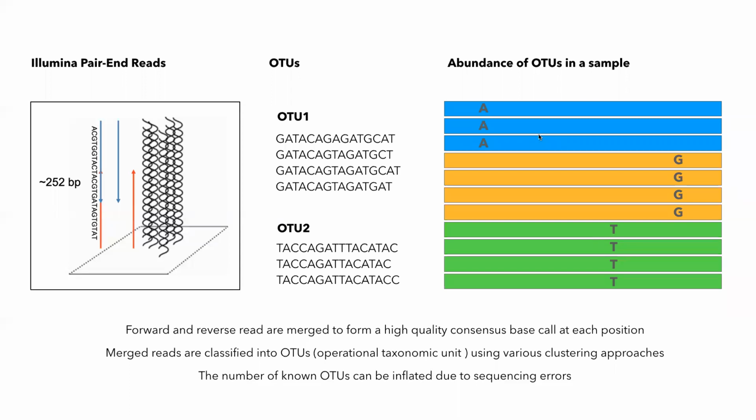So, and this is one of the challenges that we're going to be facing. As you remember, standard pipeline, we're just mapping it on database. And when we're just mapping on the full sequences in the database, really, they can fall in a lot of different places. And here we're trying to reduce this kind of diversity that is not true, right? We're really trying to get to the bottom of, well, how many of each kind do we have?